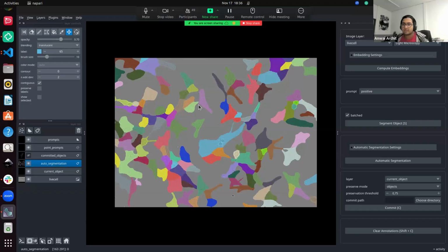If that is not the case, then we go to the next part. Okay, so this is done. You can also save things. I'll quickly show you something.